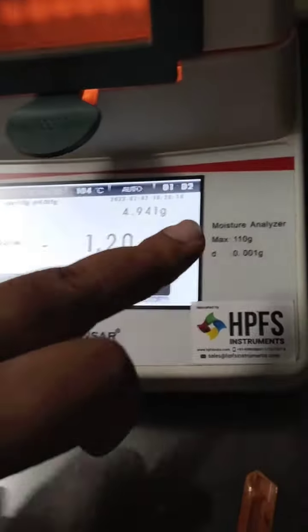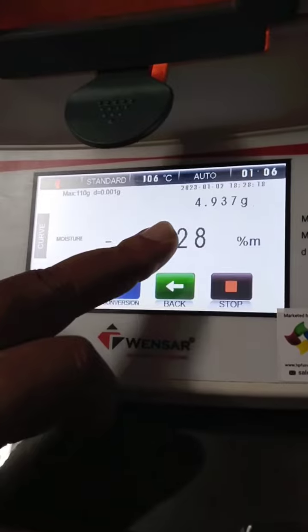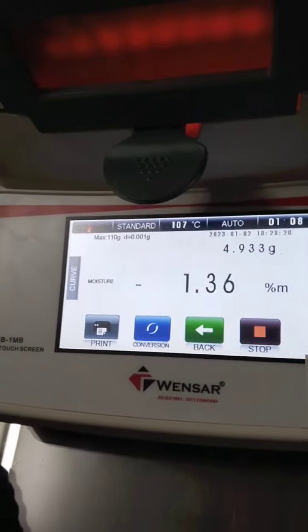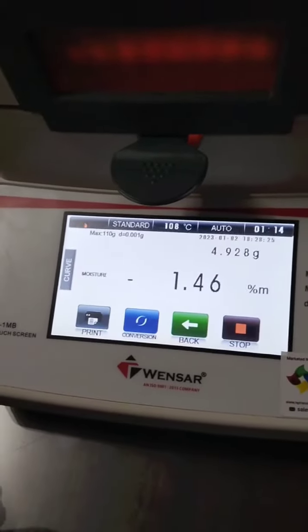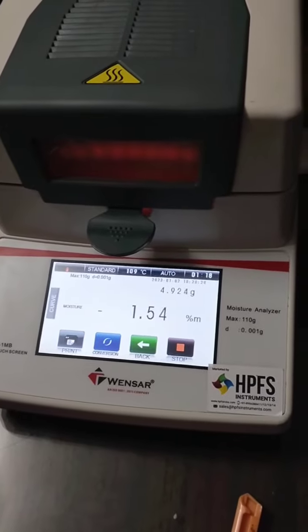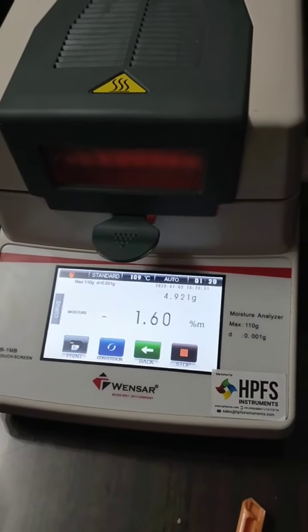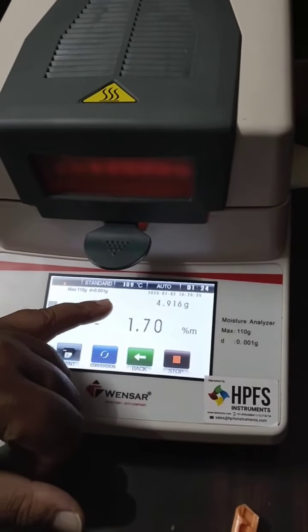Within 1 minute the temperature is reached. The heat will drop and the temperature will be better.